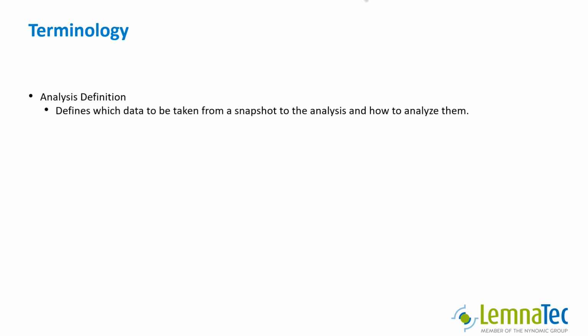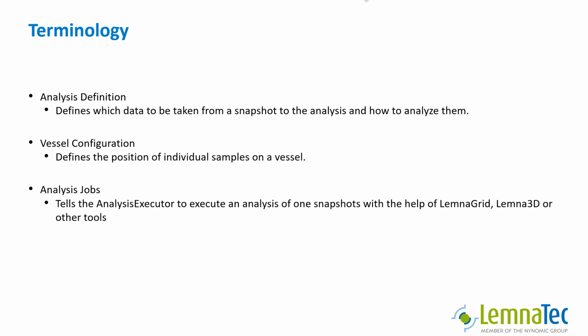An analysis definition contains all information required to execute a specific analysis on some snapshots. This may include a vessel configuration. A vessel configuration defines where to find individual samples within an image. Each analysis job then combines an analysis definition with a snapshot, so the analysis executor knows how to execute the analysis of the snapshot. So with these bits of terminology out of the way, let's go into LemnaExperiment.